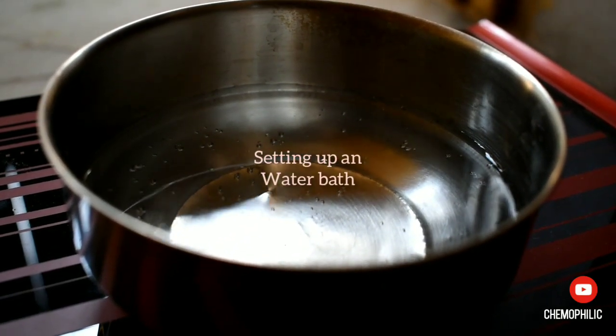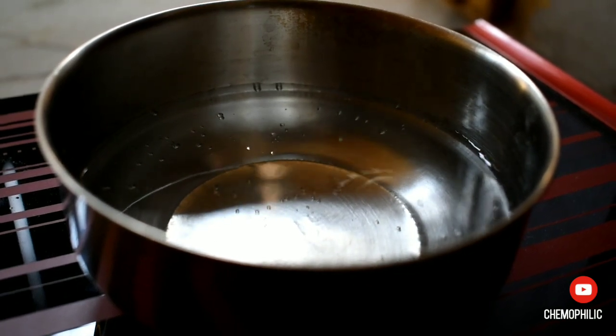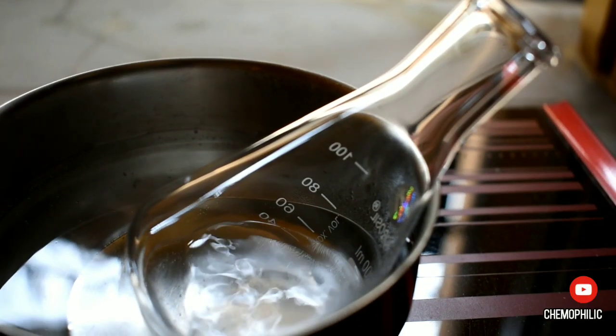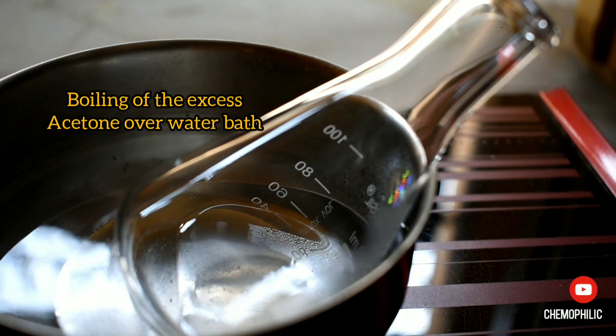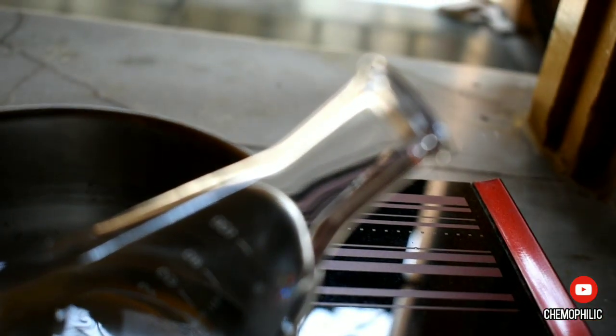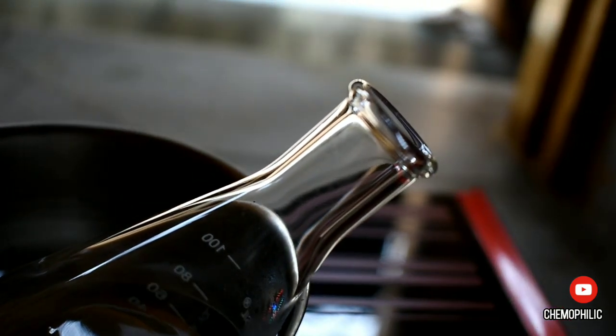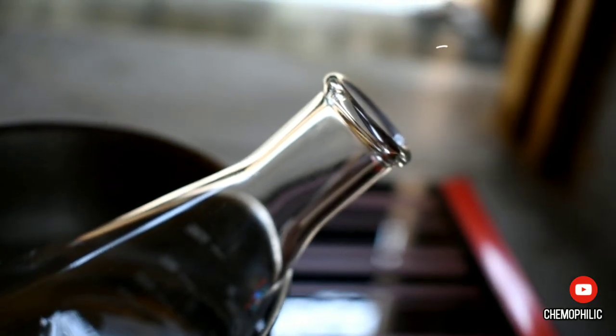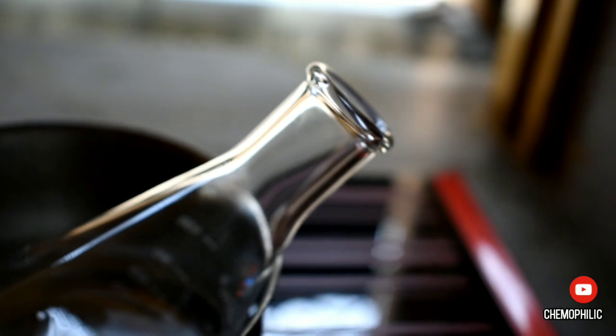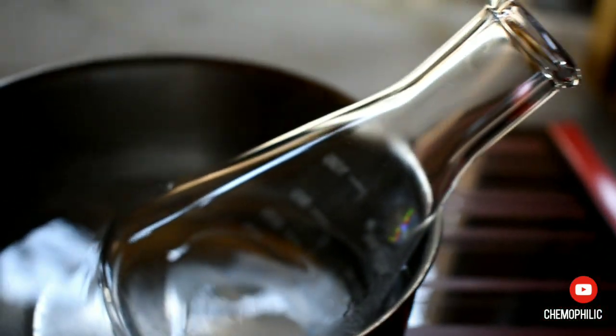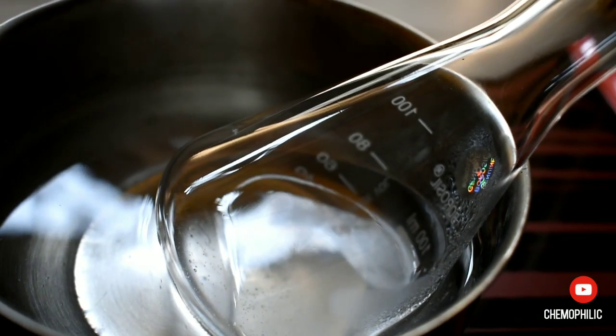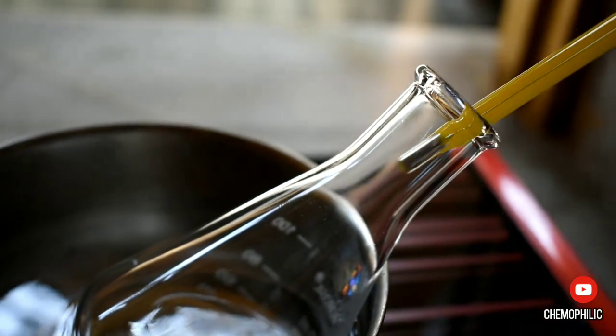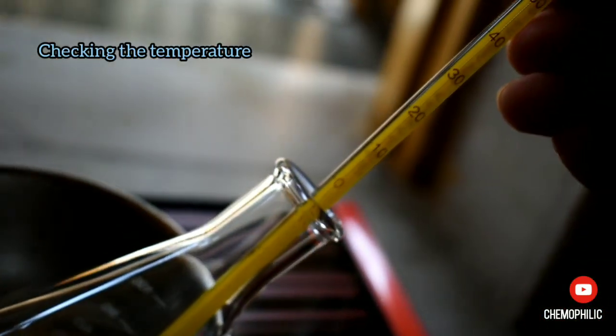Then I set up a hot water bath to boil off the excess acetone from the mixture. Both acetone and chloroform boil below 60 degrees C and can be removed easily by boiling. The vapors of acetone are evolved and you can perform a distillation setup to condense back the vapors and use it later for cleaning purposes. The temperature was around 60 degrees Celsius.